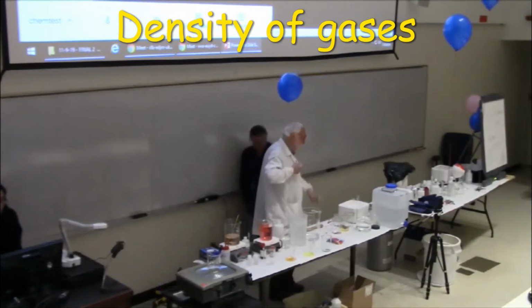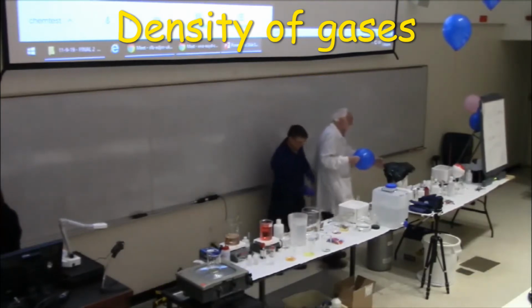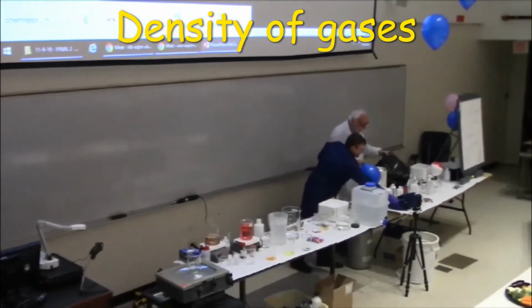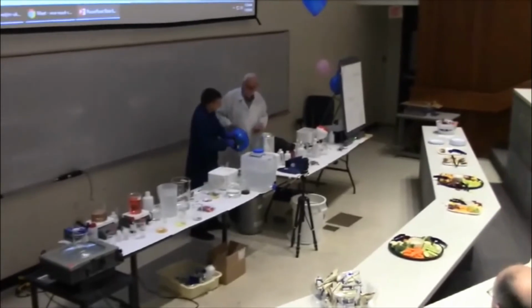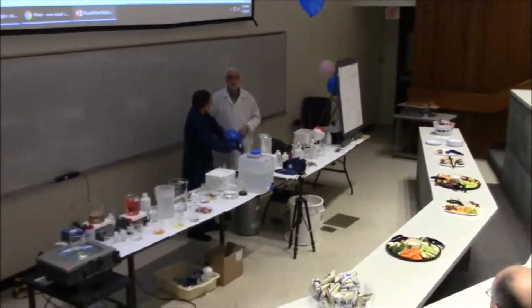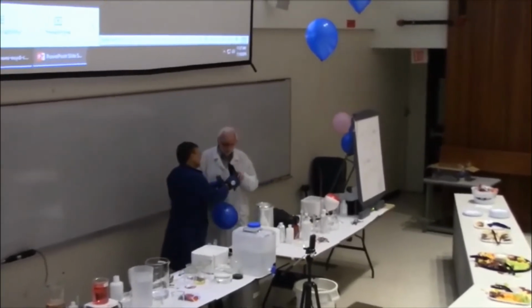Alexey, can you? I'm waiting at the one to print this. Oh, okay. So I can help you with this. I don't know which. You pour this initially. Oh, wait a second. I can see my $1,000 now. Maybe I'll go to St. Bart's for the weekend. You need this. Okay.